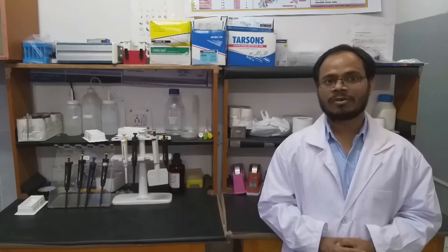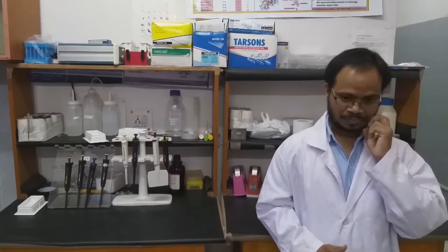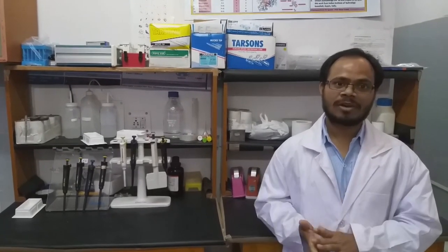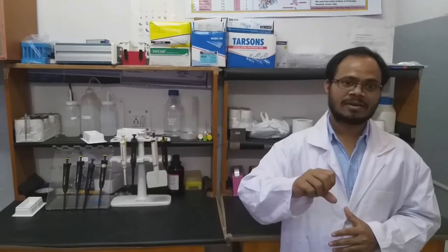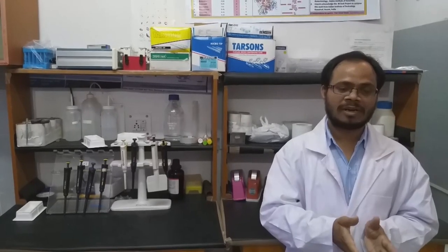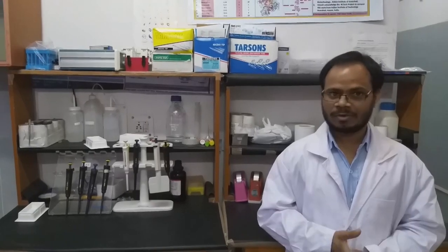And during autoclaving, we should not release pressure in a single shot after autoclaving. Let it go and come to normal pressure, then we have to open the autoclave.